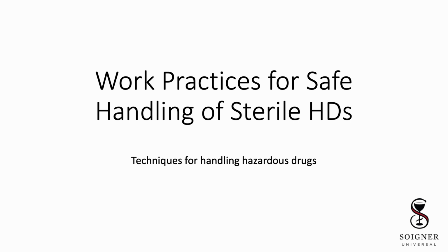It can't be reiterated enough that USP 800 is about all aspects of handling hazardous drugs in order to decrease exposure to employees in non-hazardous areas, keeping potential contamination contained within negative pressure environments. Therefore, we'll discuss a few techniques that should be employed during routine handling of hazardous drugs to help mitigate contamination.